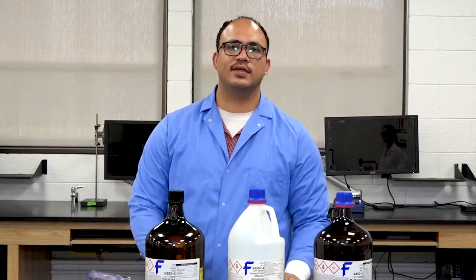So today's overall objective will be to run the paper chromatography with our different samples. We want to see if our substrates or samples are more of a polar or non-polar compound. All right, so let's go ahead and get started with today's experiment.